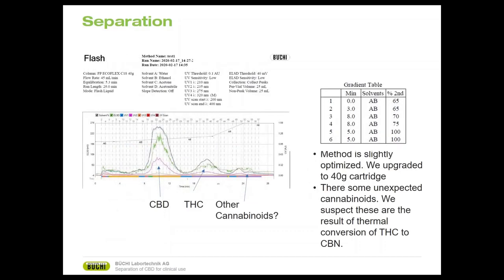On the next run, you can see the separation is much better. We used a 40 gram cartridge and optimized our method a little bit by changing the gradient table. There are some unexpected cannabinoids. We suspect that these are the result of the thermal conversion of THC to CBN. So I want to give a little bit of detail.